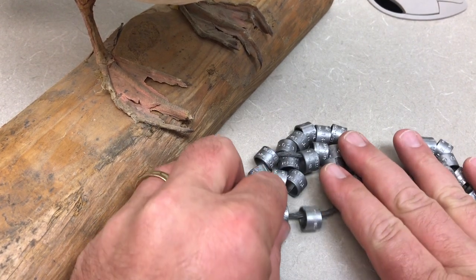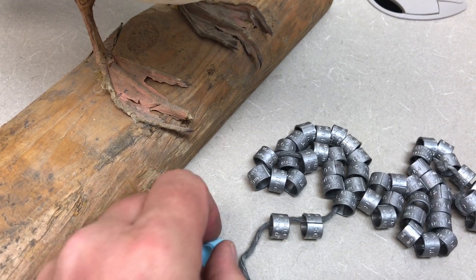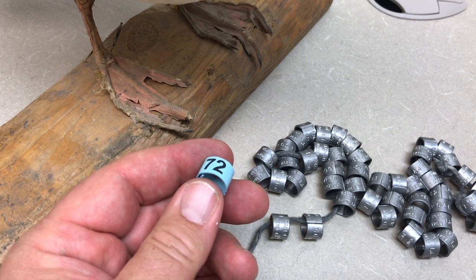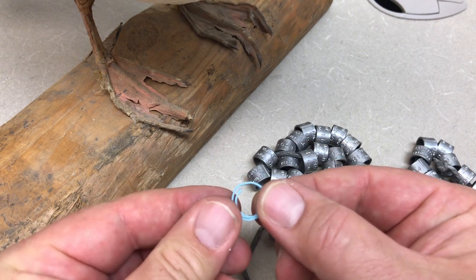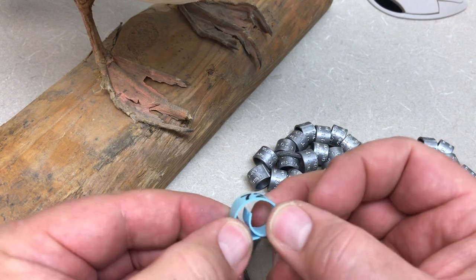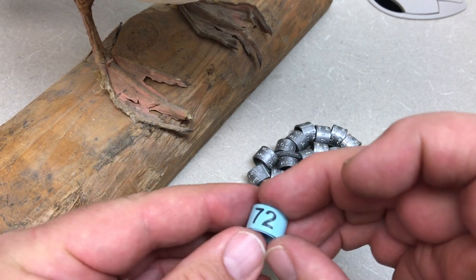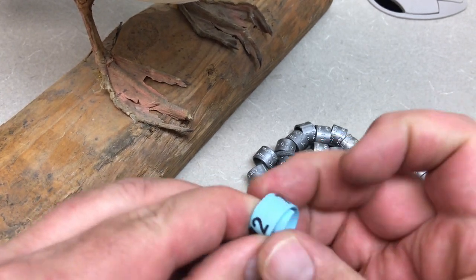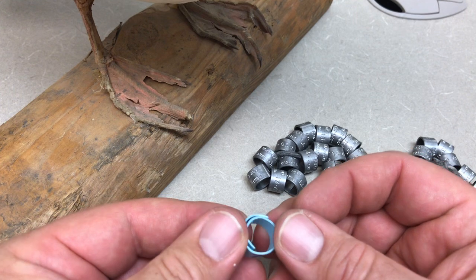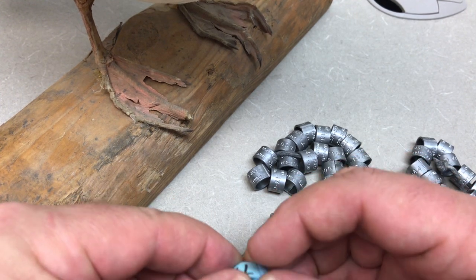I've got some prairie chicken leg bands that I want to show you and share how we use some different types of bands. First, let's talk about color bands. This is a wrap-around type of color band. We've also got various other colors — red, green, yellow, white — and they all have numbers on them. They've got this wraparound feature and you can see the number from two different sides of the leg after it's put on. This is a pretty easy installation once you have the animal securely captured and held.